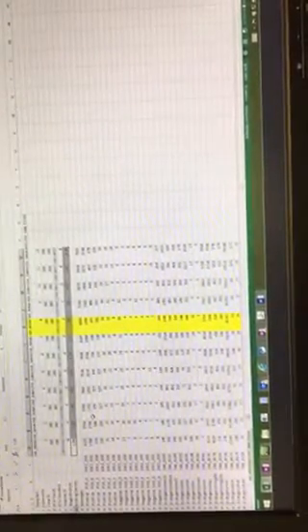So if you have a hybridization reaction that has a higher sample input, there's going to be competition on the cartridge between the positive control target probe complexes and the sample target probe complexes, if that makes sense.